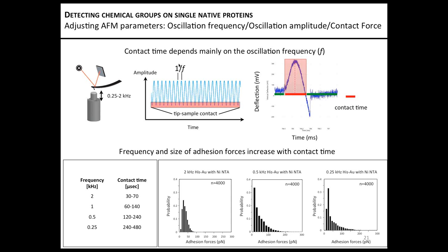Well, I can just comment that if you're talking about magnetic force measurements, in that technique it's not really in physical contact with the surface. When we sense the magnetic field or magnetic forces between the tip and the sample, a magnetically coated probe is required. In that case, we chemically functionalize the AFM probe, and then we bring it into physical contact with the sample surface, also intermittently, as was mentioned today several times, and then we probe and search for the specific interaction between the tip and the sample.